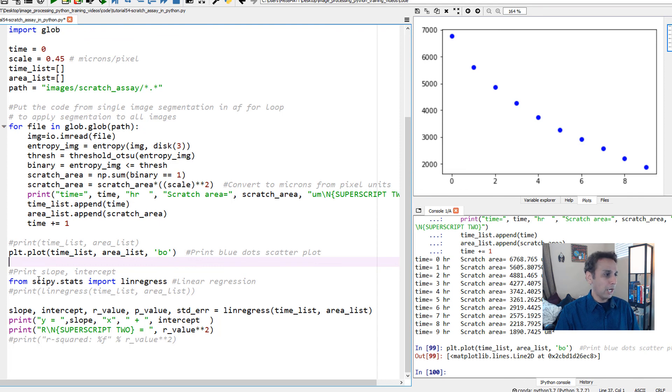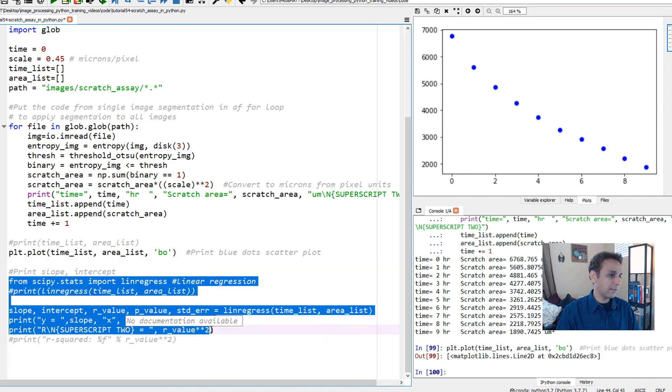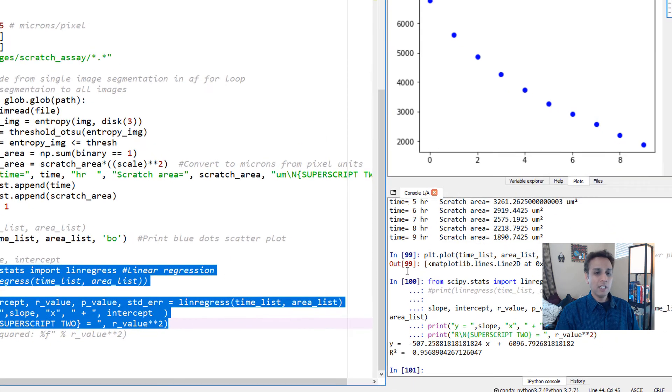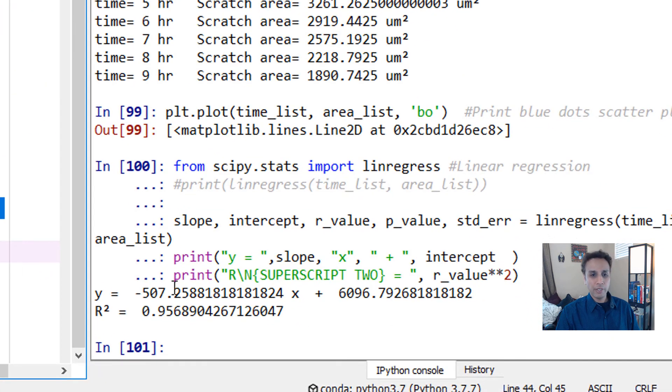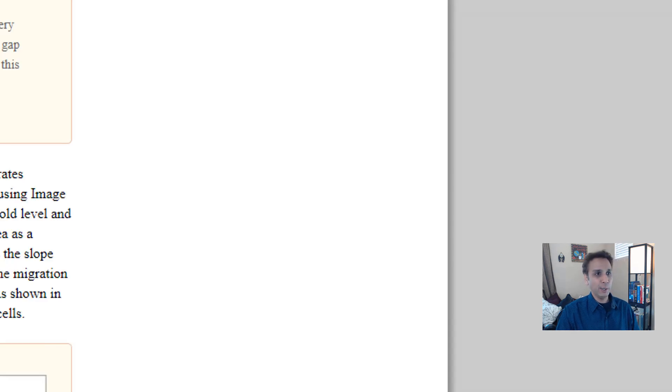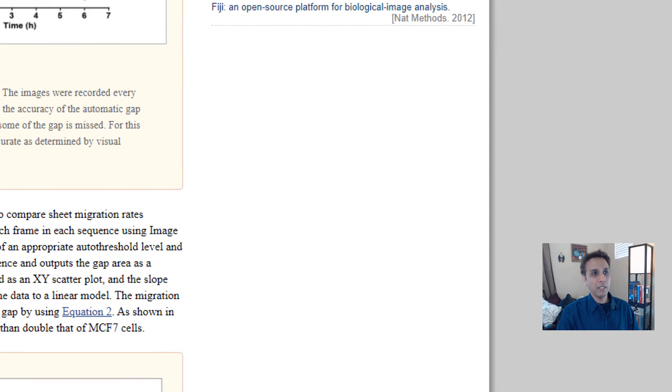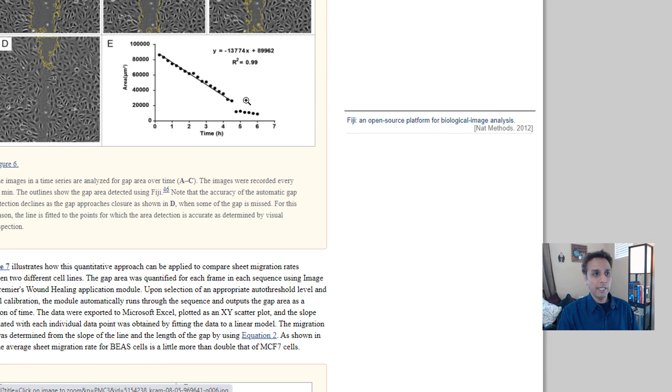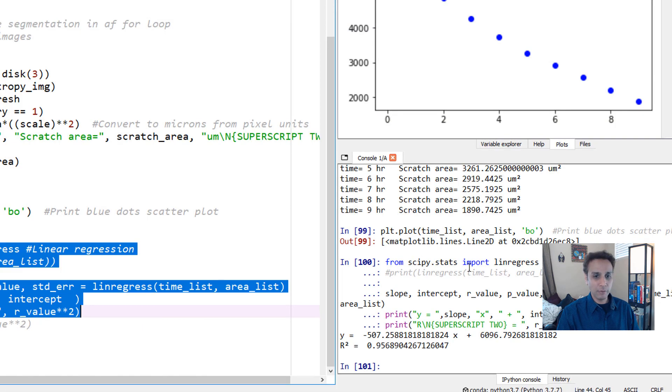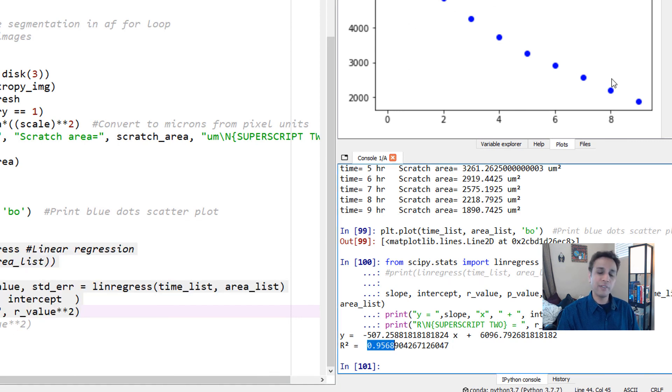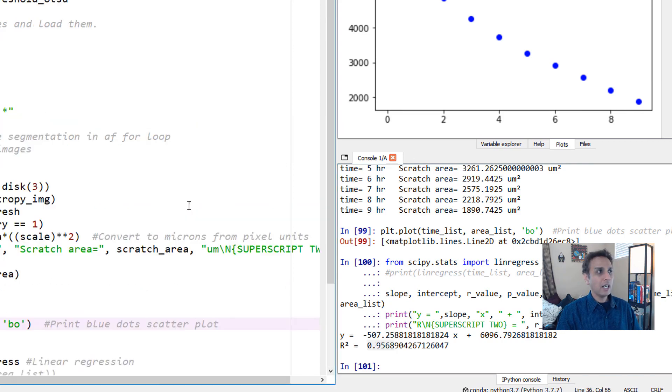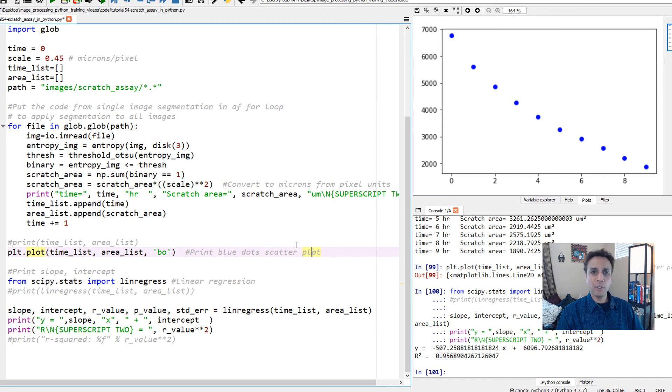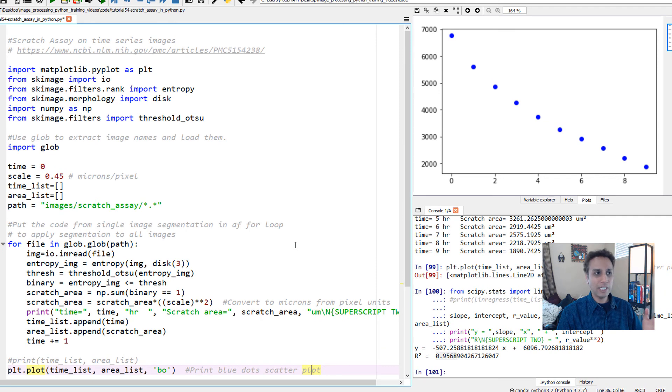Let's run these and print out the values. Here is our equation: y equals minus 507.2588, just like these guys did. They got R squared 0.99. Obviously our R squared will not be 0.99—we got 0.956 because this looks more curved than linear. This is how you can do scratch assay analysis with a few lines of code.